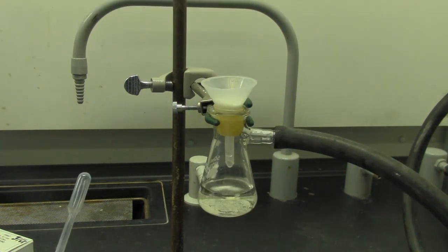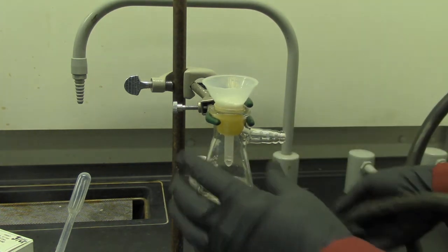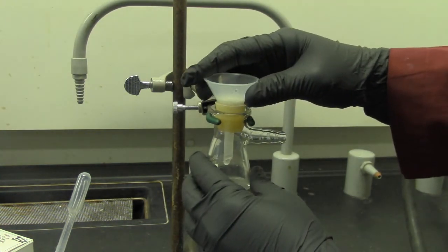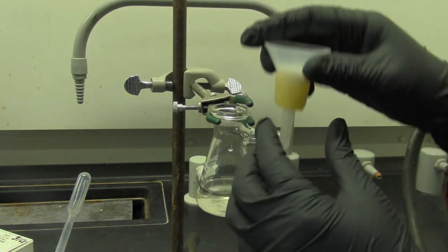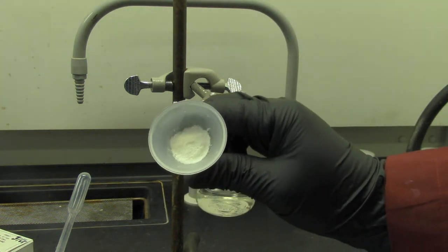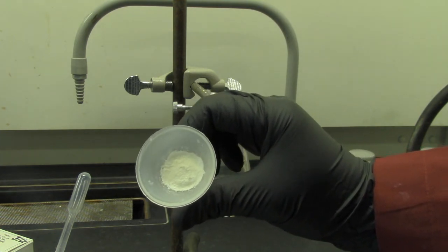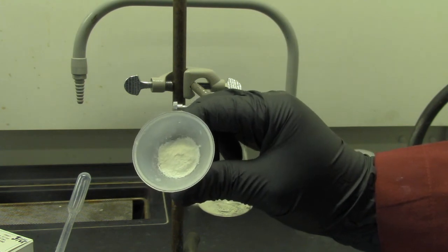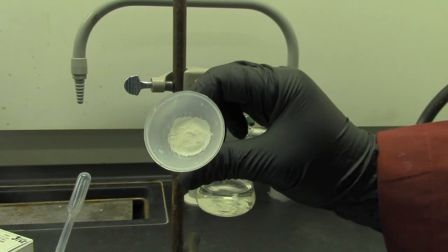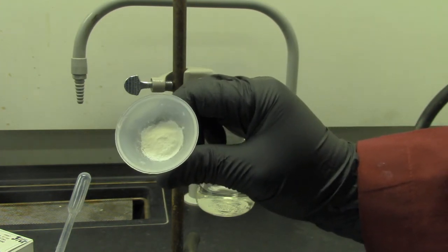So vacuum filtration is done. So disconnect it. Turn off the vacuum, and I have my benzoic acid. Okay, this is what it looks like. It's a white precipitate this time, right? There's no crystal. So it's a white precipitate. That's what we're expecting. I'm going to let this dry in the oven. Or you can let this dry overnight, but I'm going to just bake it in an oven to remove the water.